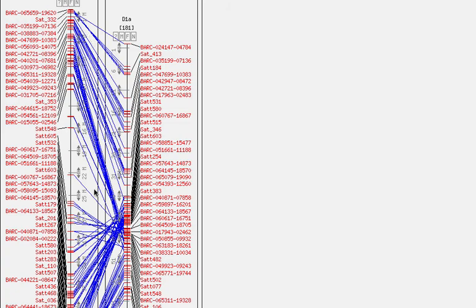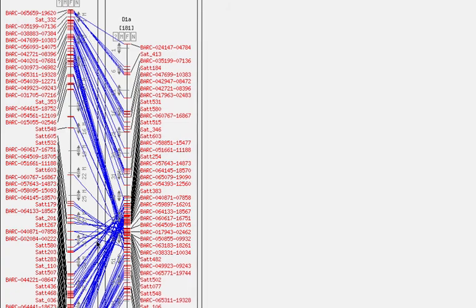However, there is a region which, as you can tell by the criss-crossing lines, tends to give you the impression that it's been misassembled, either genetically or on the sequence map.